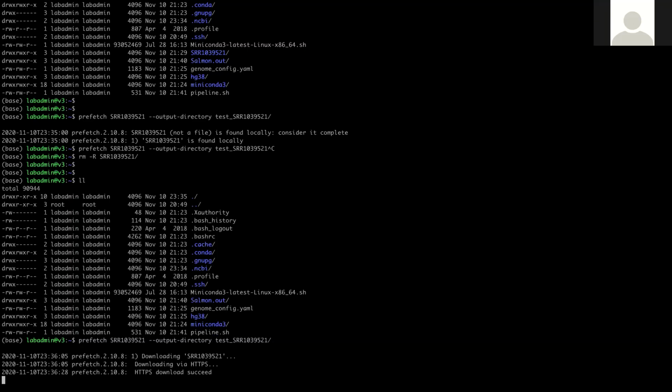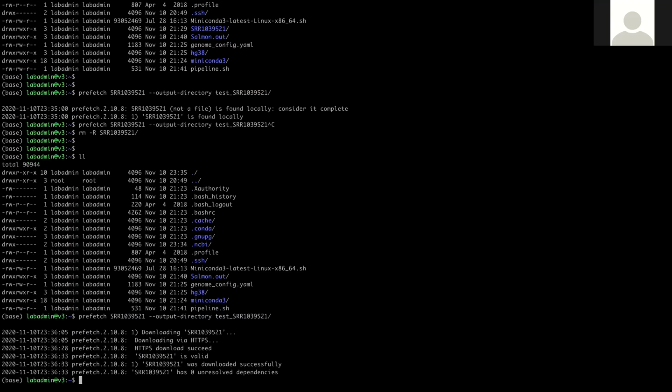I have a quick question. If we were doing this on our own computer that hasn't had any of the stuff preloaded, we would need to upload the .ncbi file, the salmon .out, and what other files, and the SRA and the SRR file? Would you say that again? Do you mean for the first time you use the software, what would you need to prepare? Right. I just want to know what exactly is preloaded right now that we would want on our own computer.